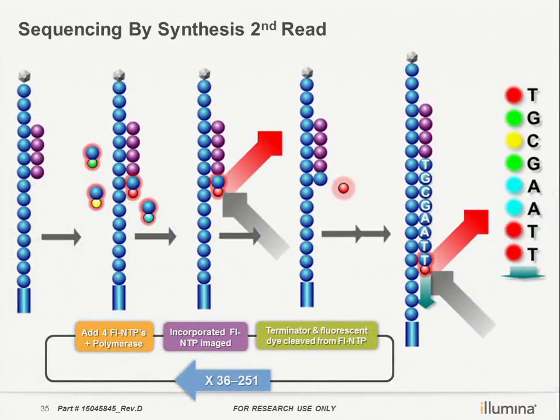Okay, so what we do, we sequence the read 2. So this is the original strand. We have the sequencing primer bind, and then we sequence the forward strand. And then you flip over, and then I do the amplification. And then linearize, original strand washed away. So this is the reverse strand, and then the sequencing primer binds, and then I do the sequencing.